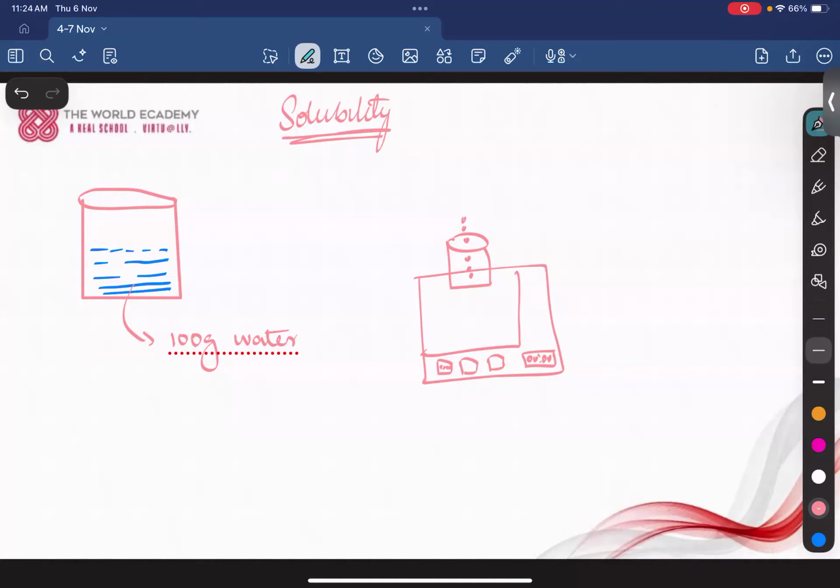It is difficult to get exactly 100; you might get 101 or 99. If you put a larger drop, you will get more, and if you remove water, it will also contaminate the system, so it has to be done very carefully.